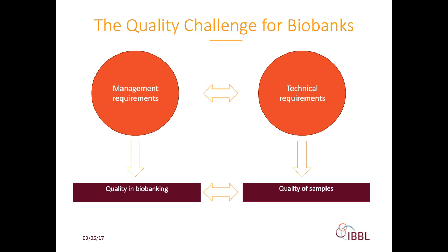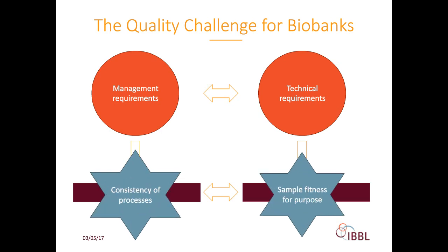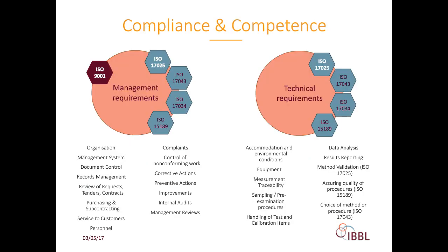In other words, biobanks have to ensure consistency of their processes and fitness for purpose of the samples for the different downstream analytical applications.